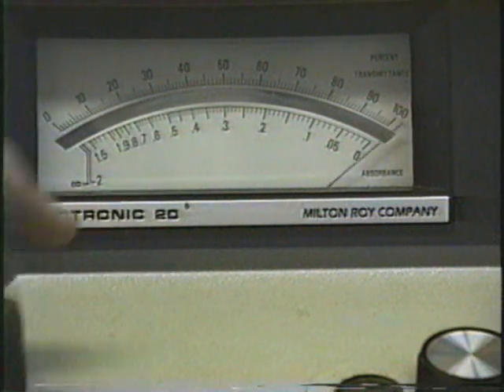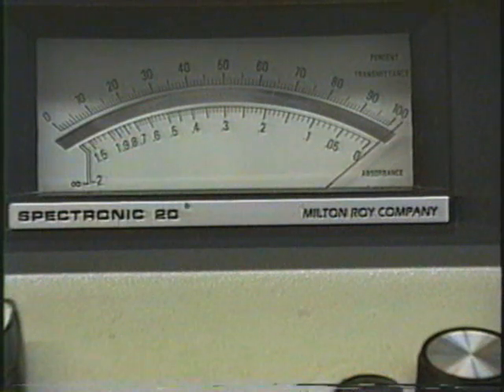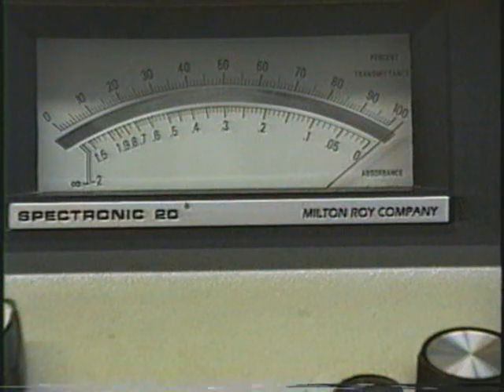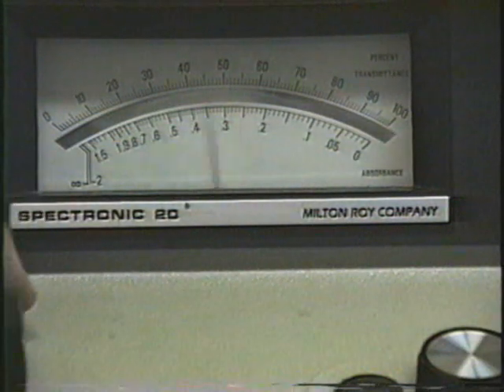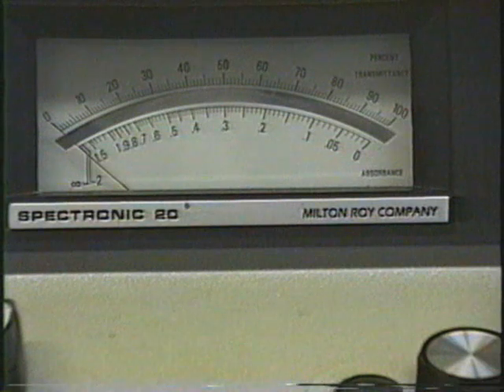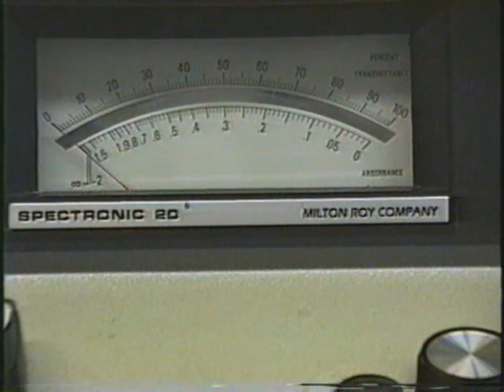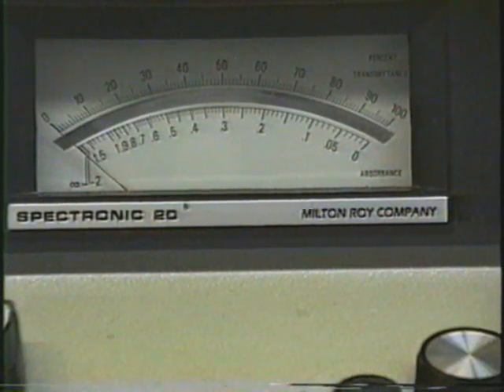So let's put it in here and see what it reads. Now we don't do any more adjustment, we just read. And you see it's reading a little over 100%, so we'll have to estimate. I would say that's 102.0%. Now, you'll go through everything we did a second time to make sure everything is reading right. Then you will go back and make a solution and bring your solution to the spectrometer. Let's do that now.